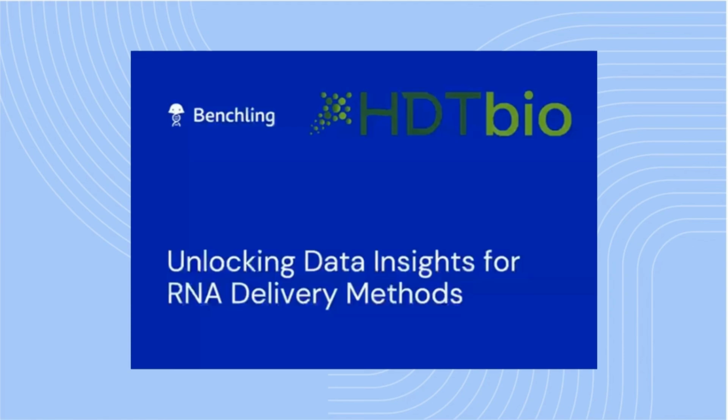The first one is you can onboard a CRO as a user on your Benchling tenant. What this allows for is they can enter any assays or research they've done directly into that tenant, and then scientists at your organization will have direct access to that experiment, but also the experimental context in real time. This is probably the most involved version.